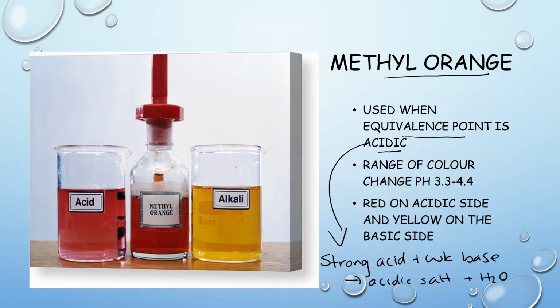Now, it changes about pH of 3.3 to 4.4, and on the acidic side it's pretty red, and on the basic side it's a nice looking yellow.